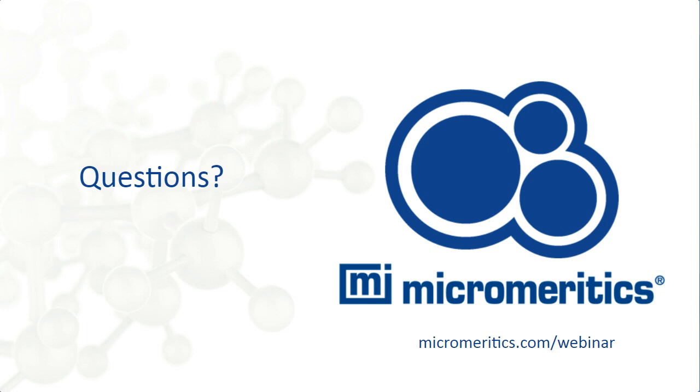Okay, great. And I think in all of the data that you presented, there was some information on the repeatability. I think there were error bars on all of the graphs, but perhaps you can just comment on how repeatable the measurements were. Yeah, so in general, we would have done the measurements in triplicate. For some of the caking studies, we didn't show the repeats on those. It would have been too much data to show in one graph, but we would have had repeats on each of those measurements.